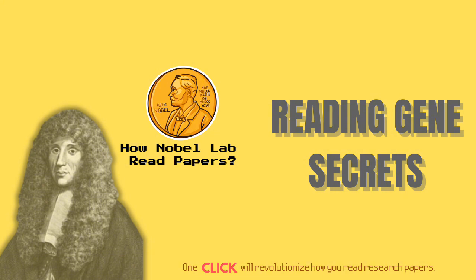That's huge. Low stuff, high stuff, it can measure it all reliably. A massive improvement. 5 orders. That's like measuring ants and elephants on the same scale accurately. And they introduced a new way to quantify things too, right? Became a standard. Yeah, that's right. RPKM, reads per kilobase of transcript per million mapped reads. Bit of a mouthful, but a really important concept they introduced.